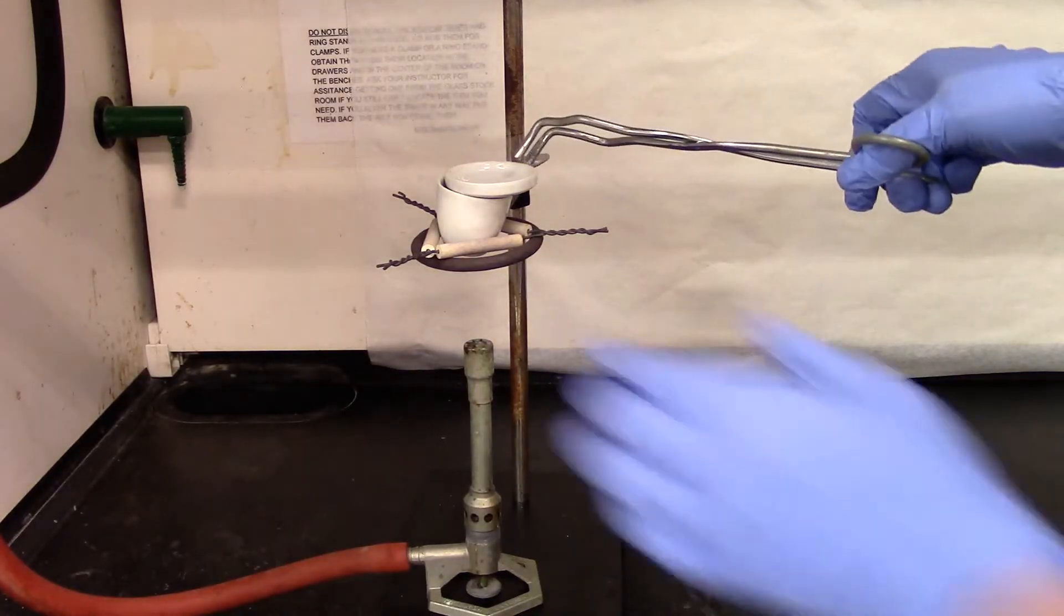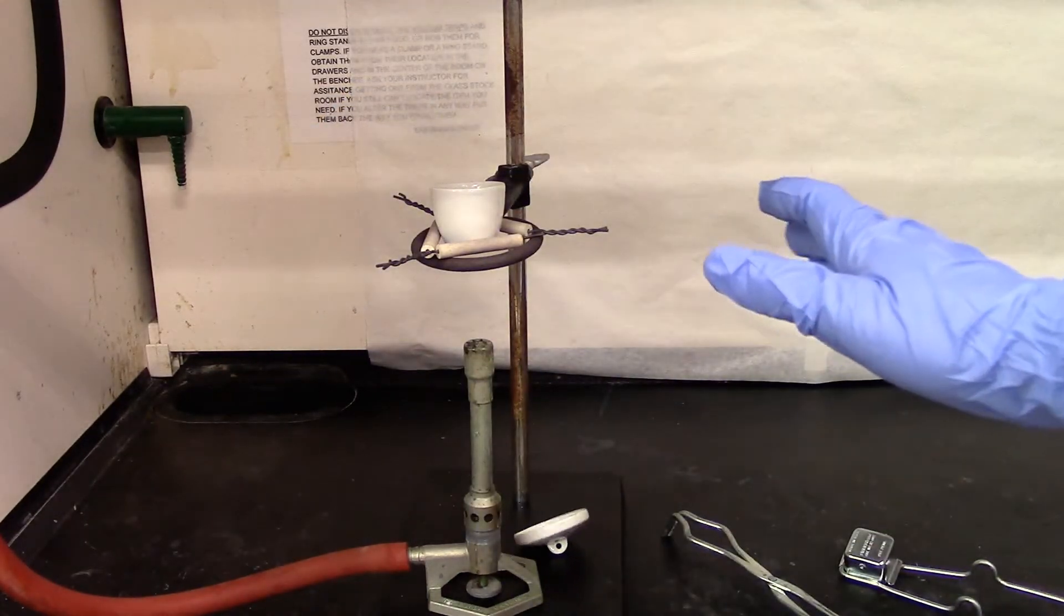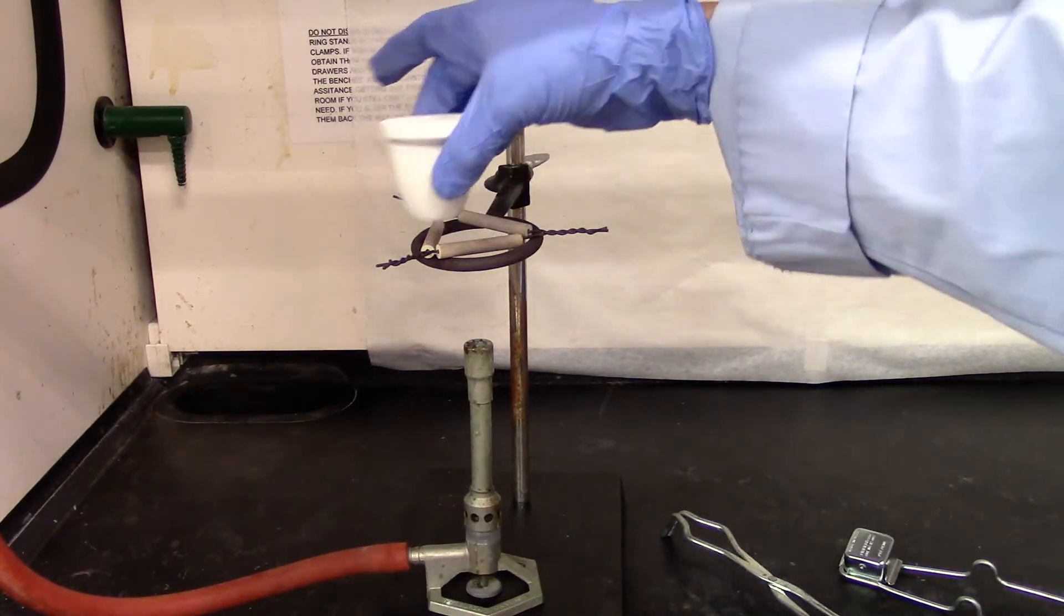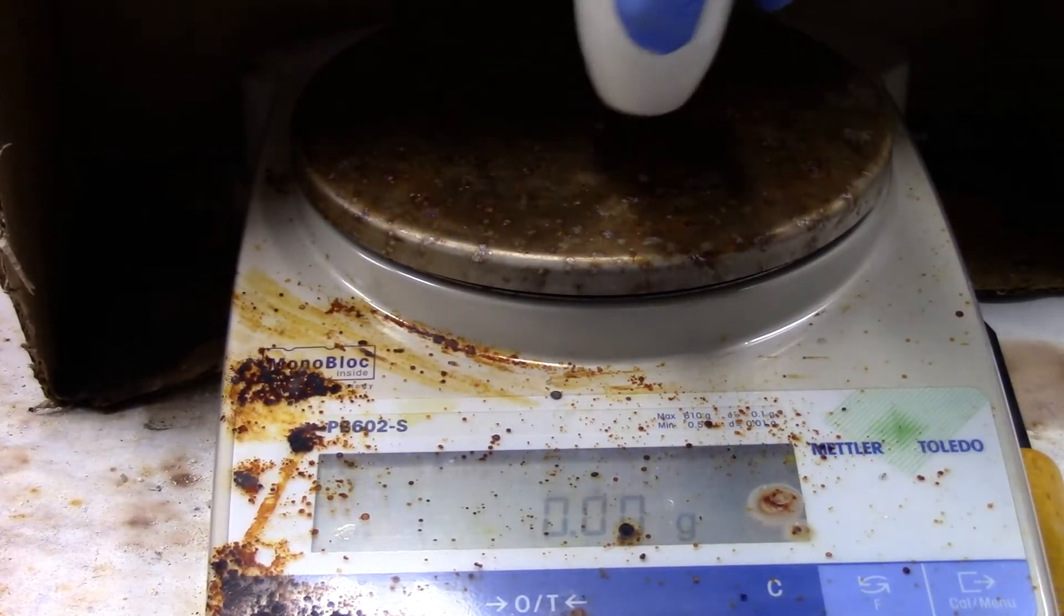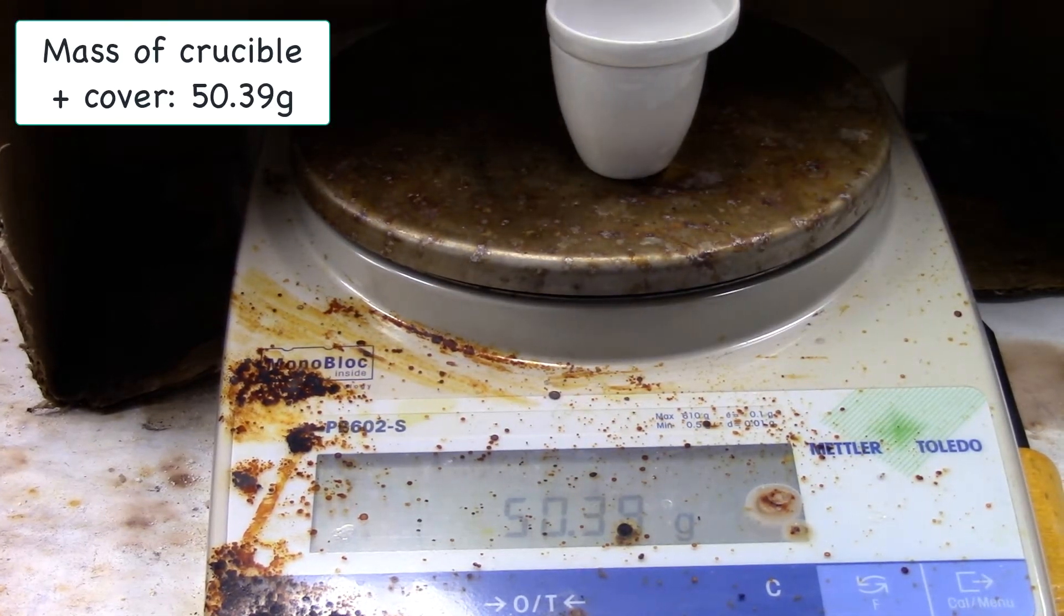So I'll check if it's cooled down. Feel it gently. So it's cooled down. I'm going to take the crucible and the lid and weigh it empty. I'm going to tare the balance and put my crucible with the lid. So that's the mass.